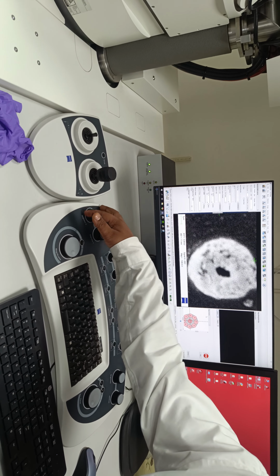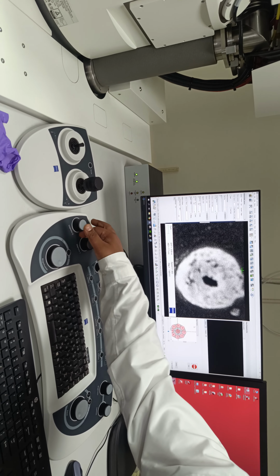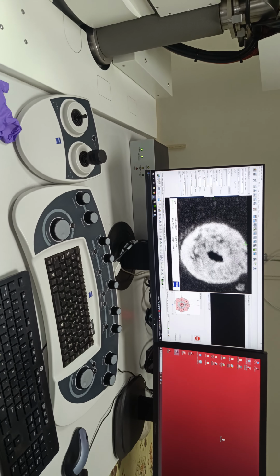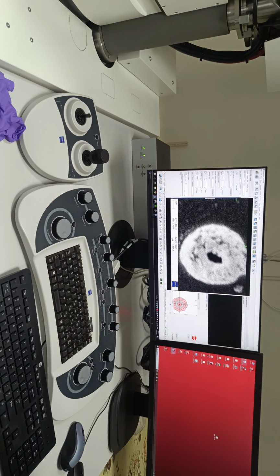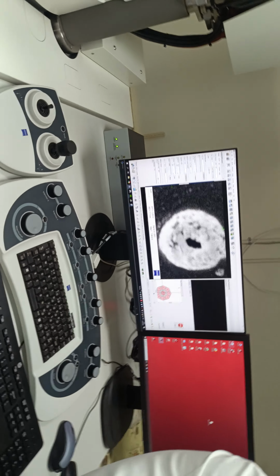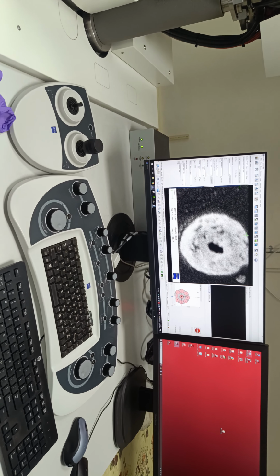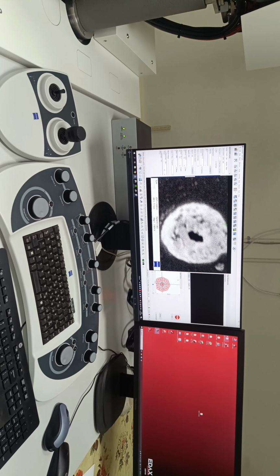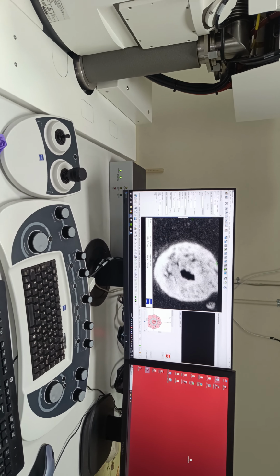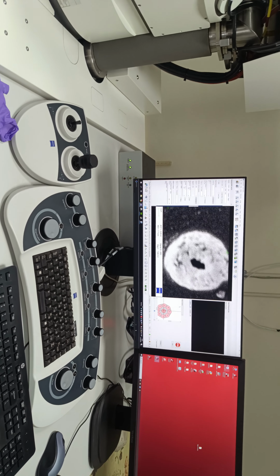These are nothing but the coils, the astigmatism coils, electromagnetic lenses, positioned on the final part of the electron column. Now, how do we control an electromagnetic lens?